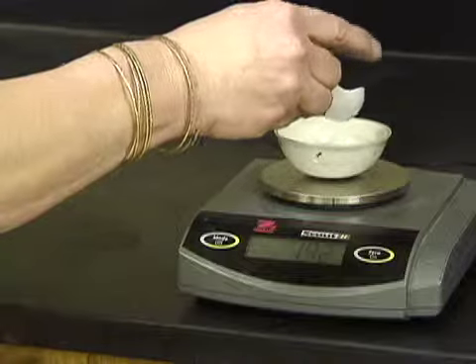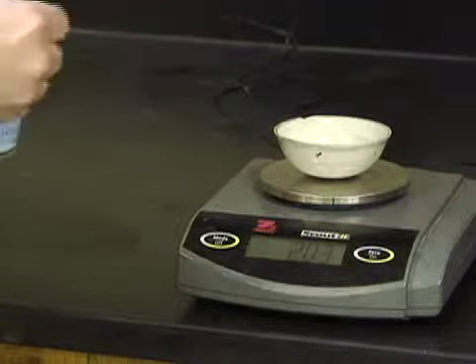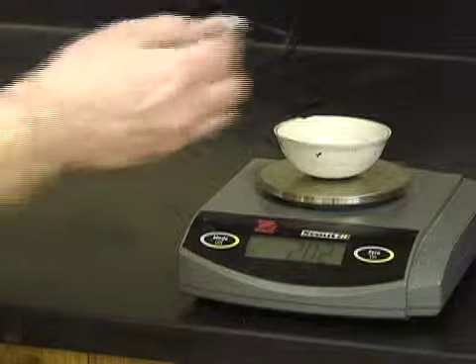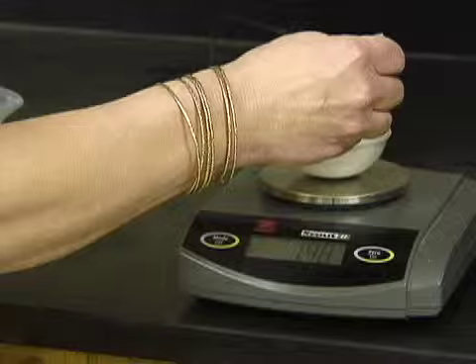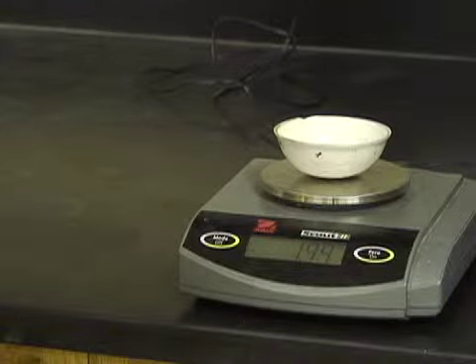Very, very close. We never pour materials back into the original container. I have to have my excess container. Now, this is just a tiny little bit. 2 point, oh.